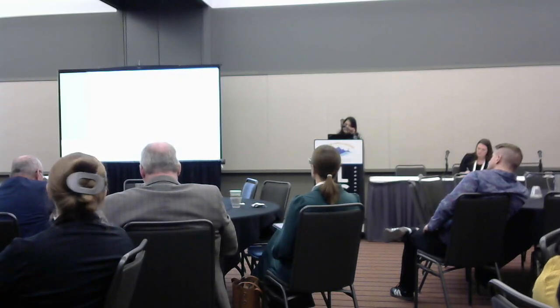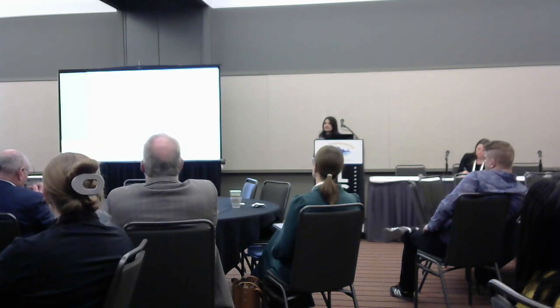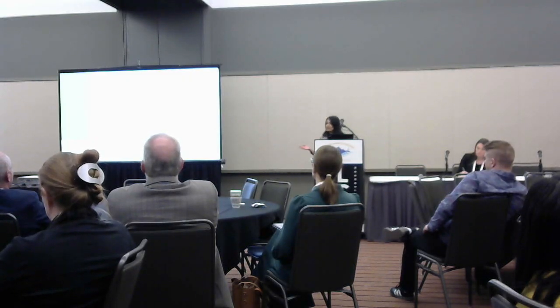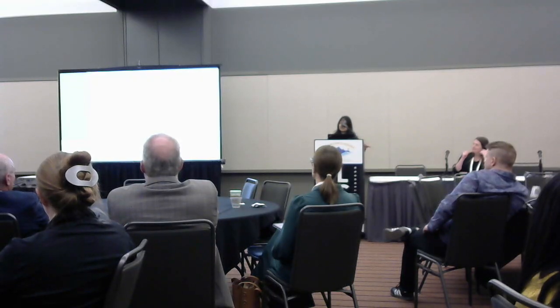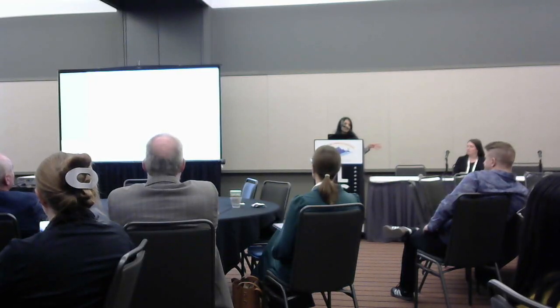And then the main thing is also, because it's a Linux native system, any Windows or Mac native applications are also not currently portable with our HPC. And sadly, that includes most of our microscopy-based applications. Some of the ones that we have in the core, Zen, Arivis, Imaris, NIS Elements, sadly, none of these are compatible with the HPC.